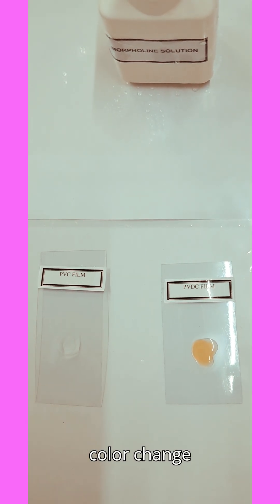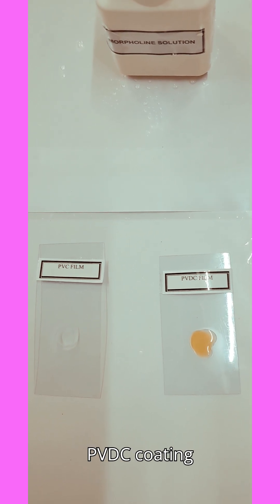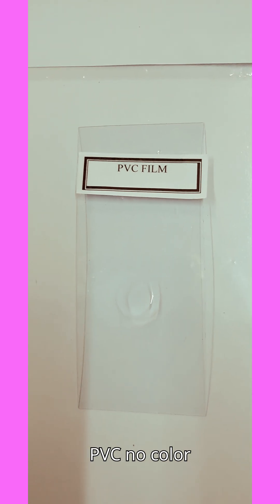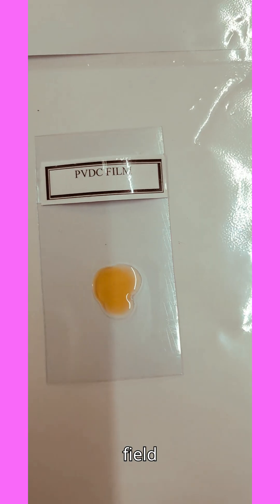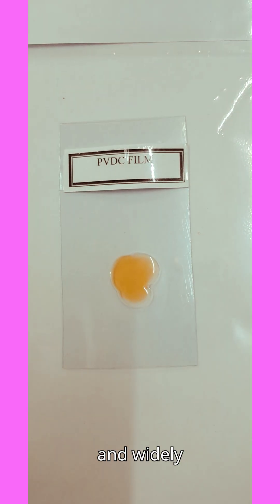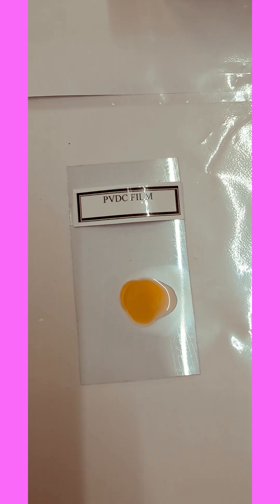Observe the color change over 10 to 30 seconds. On the PVDC coating side, you'll see a yellowish to brownish tint. On the PVC side, there is no color change. This test is fast, field-deployable, and widely used in packaging lines for batch verification.